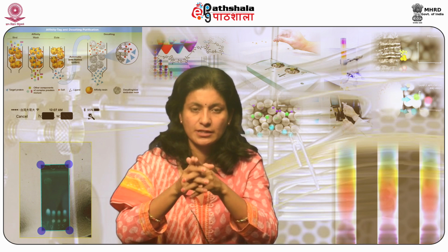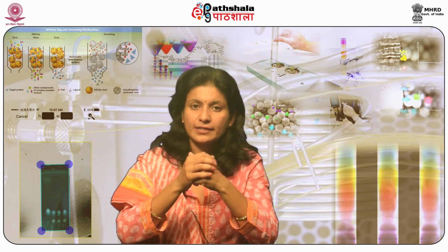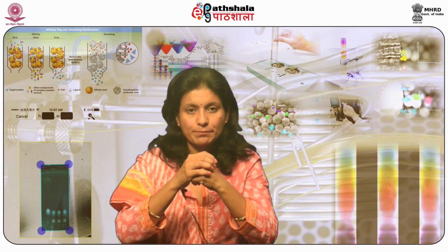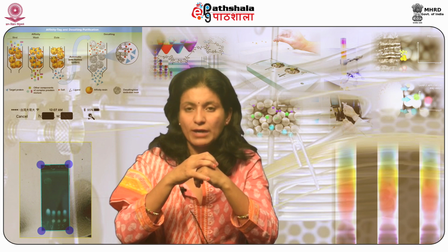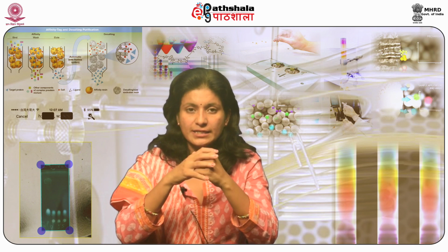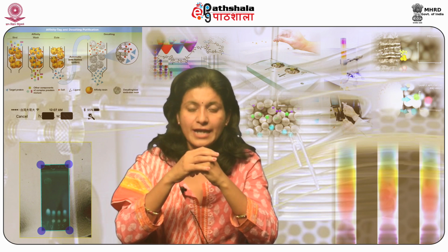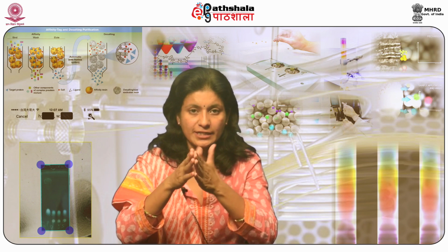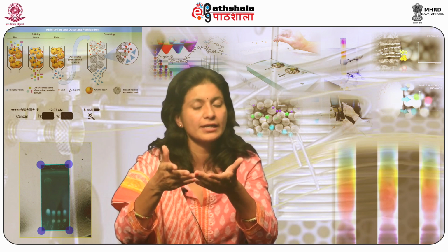Bioactive natural products. These products are the chief source of functional foods, food additives, and new types of drugs. They consist of secondary metabolites, for example, alkaloids, sterols, flavonoids, etc., in animals and plants generated through biological processes. IEC is one of the most often utilized techniques for the separation of natural products in pure form. It is a core, fundamental and efficacious technique as it is inexpensive and offers high recoveries of key analytes.